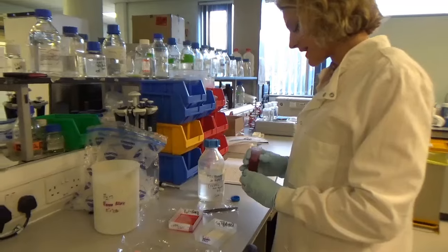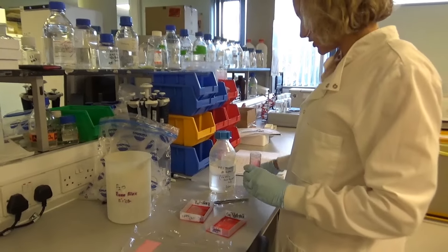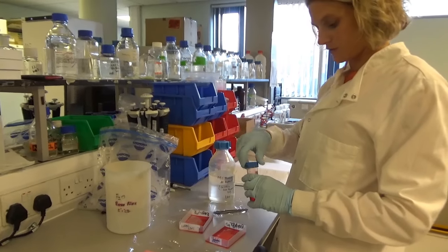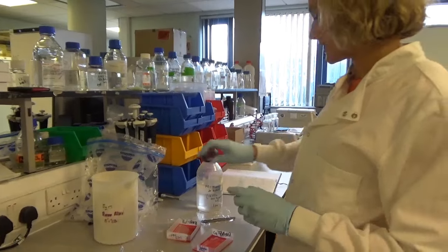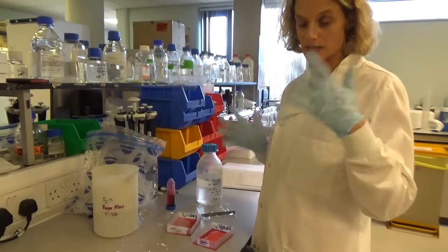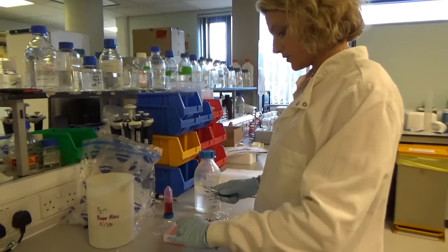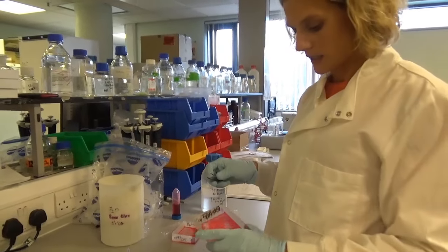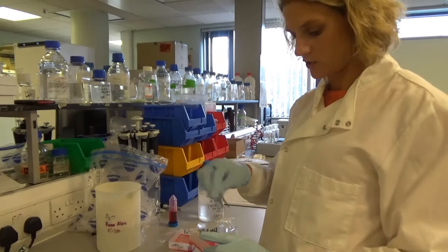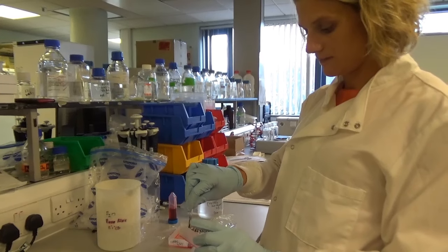protein here. Every experiment I do about 8 of these blots, because I'm looking at a different protein each time. So you either overexpress, or turn up the gene, or you knock it down, and then what I do is see how that affects the cell in terms of how it can respond to insulin, which is obviously important in diabetic kidney disease. So to do that, I need to look at a number of insulin signaling molecules, so the insulin receptor and other things like that. So each of these individual blots I'm staining for a different protein.